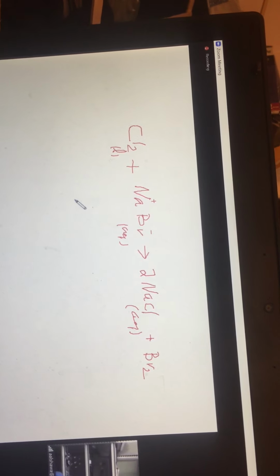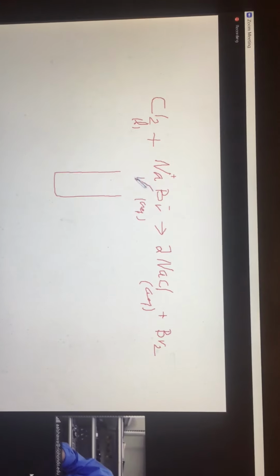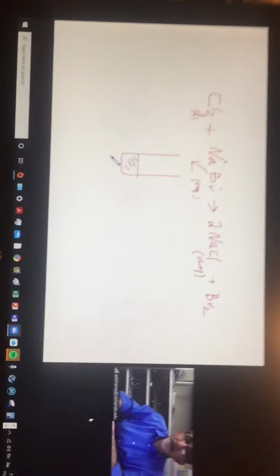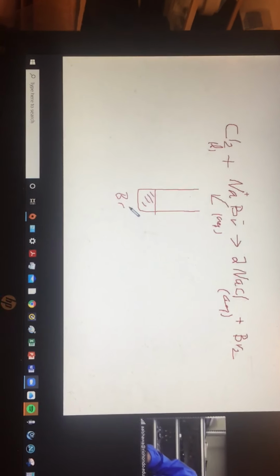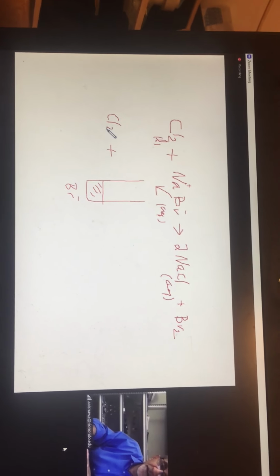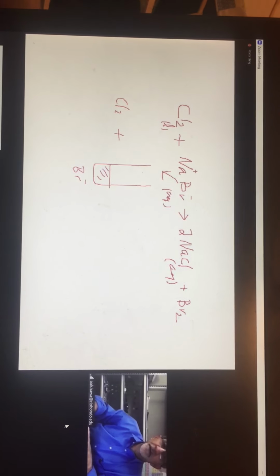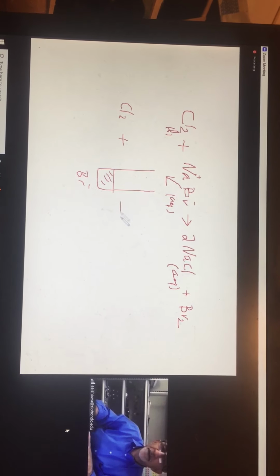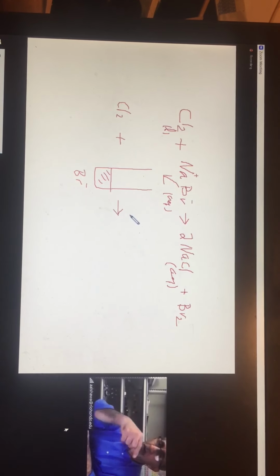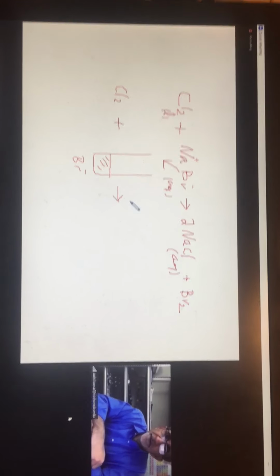If you start with the following test tube that has the bromide solution, add some sodium bromide in here, maybe a few milliliters, 1 milliliter or so. So that's the bromide. And if you add, let's say, chlorine to it, first you are trying to infuse them together, mix them and have them react if there's a reaction. And then once you shake them or give them time to mix, you need to add some sort of organic layer to let the molecules migrate.